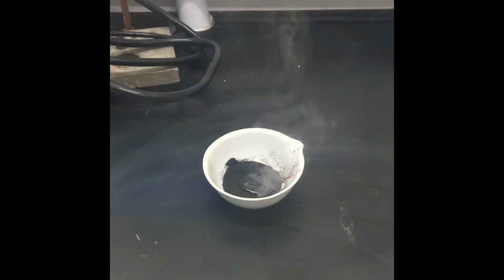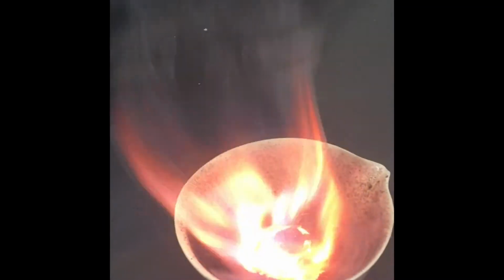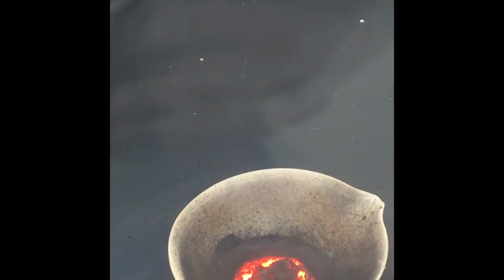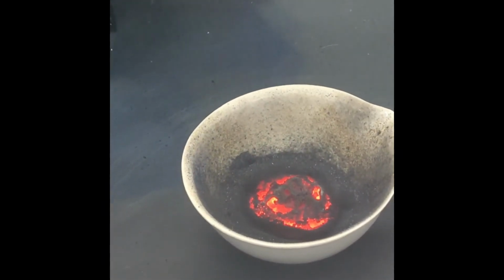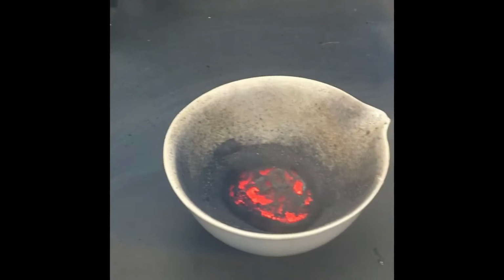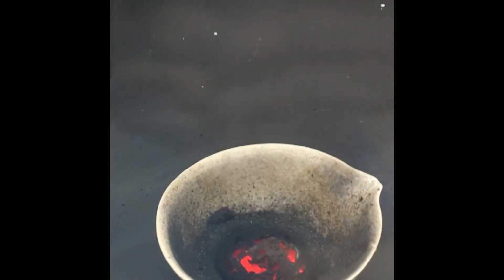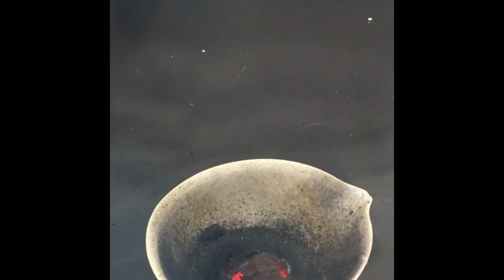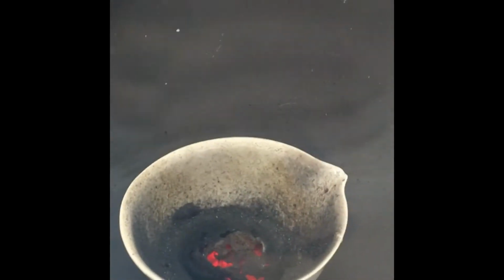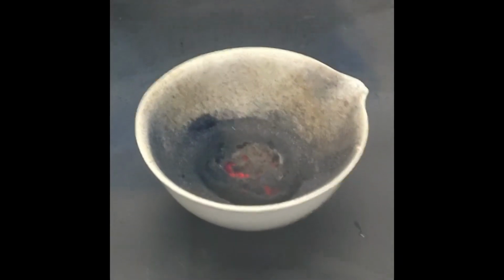All right, look at this. Nice. A lot of flames. Oh, and that looks like a volcano actually. That is very nice. Wow. Now you probably saw that the flames were purple. That purple again was from the potassium, as we saw with the gummy bear and the Swedish fish.